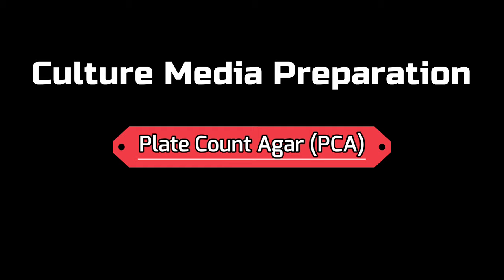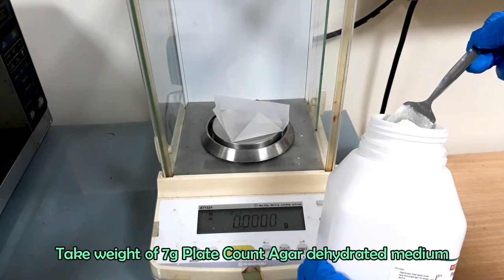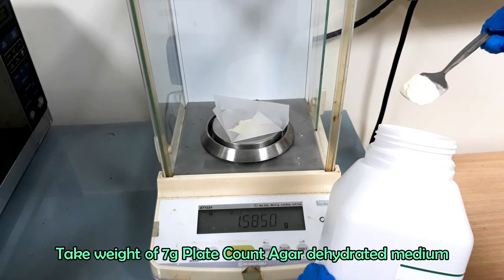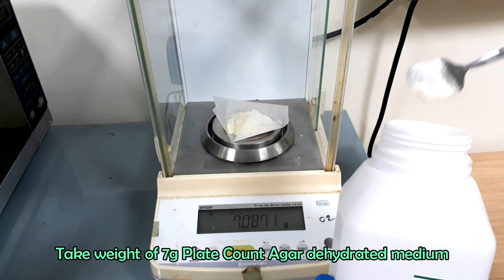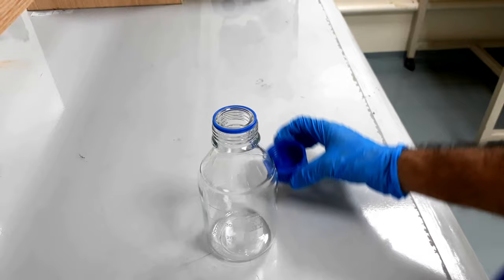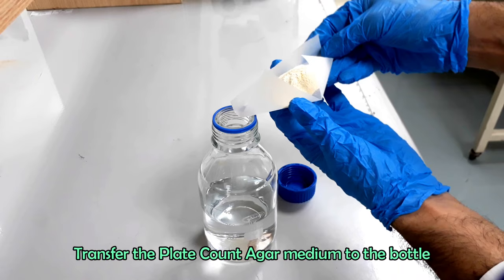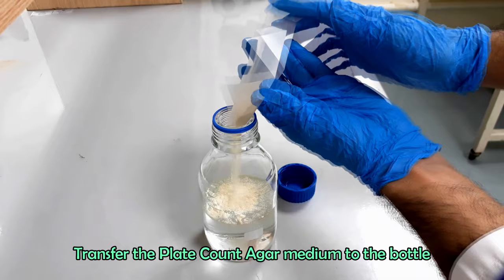Now we will prepare plate count agar. Take a weight of 7 grams plate count agar dehydrated medium. Take 300 ml distilled water into a Duran bottle. Transfer the plate count agar medium and swirl to mix the content.